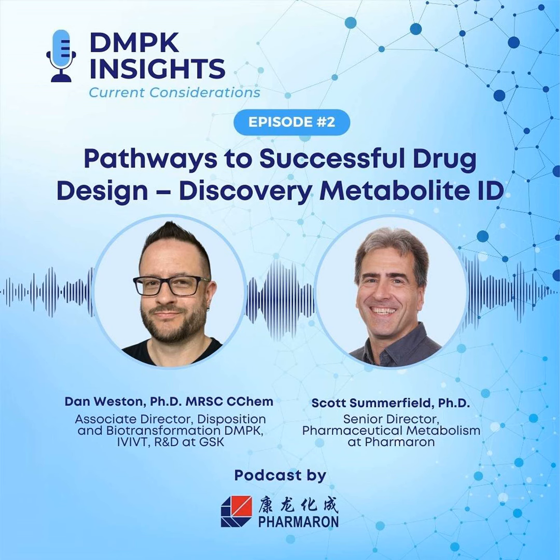They're the easier to find, and they're the things that we want to reduce that manual intervention on, make it more joined up and make it more streamlined so that we can hit a tighter turnaround time, but still have quality data. Yeah, and there's still the opportunity to look for things like reactive metabolites that may be there, even though they may not be the most abundant on mass spec signal, but you'll still have intervention to see unusual metabolites that might not come out in the standard top 3, top 5 prediction.